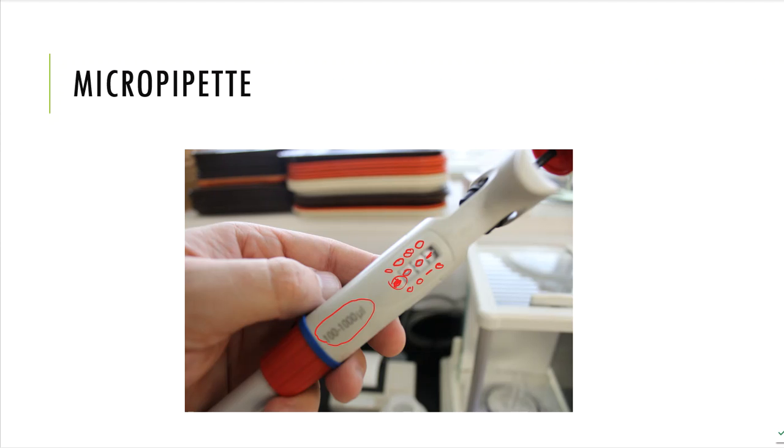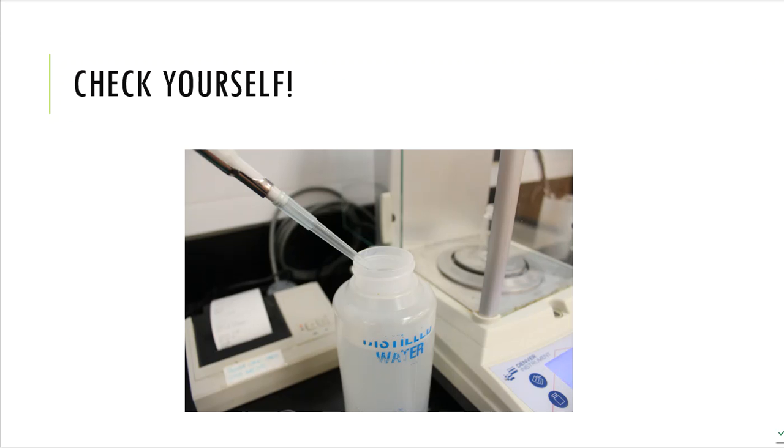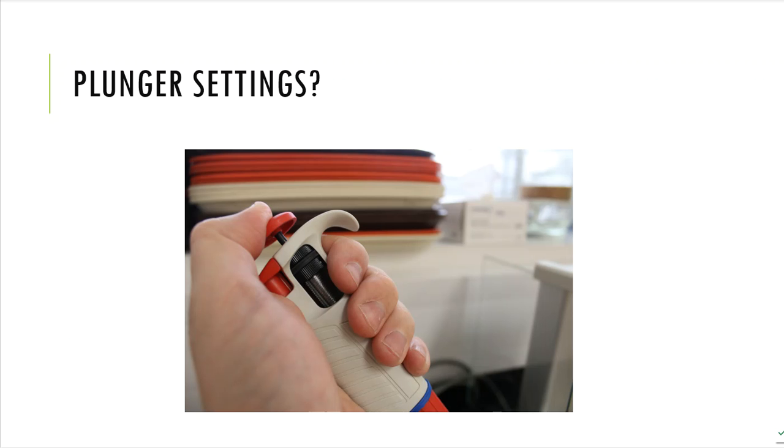All right, so I dialed this to 1 milliliter, and the way that I use this thing is that I'm going to put the tip of that into my DI water, because that's what they want me to pipette. So the tip is going to go in, but before I put the tip into that water, I want to create an air pocket first. I need to suck that water up into that micropipettor tip. So I have to push down on the plunger up here at the very top.